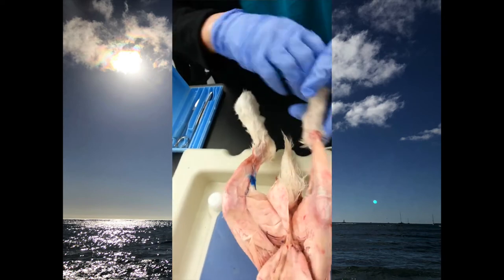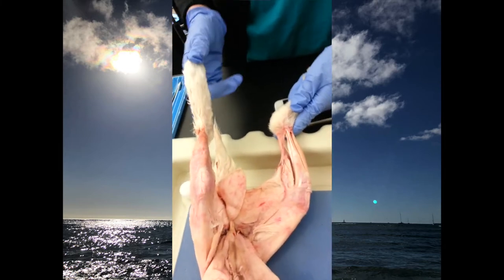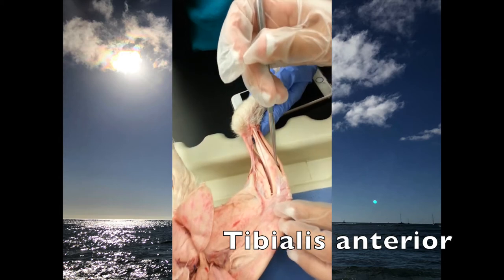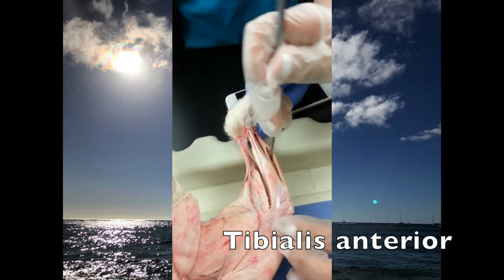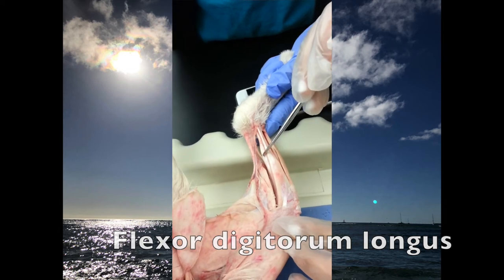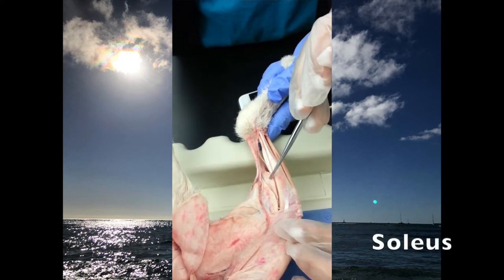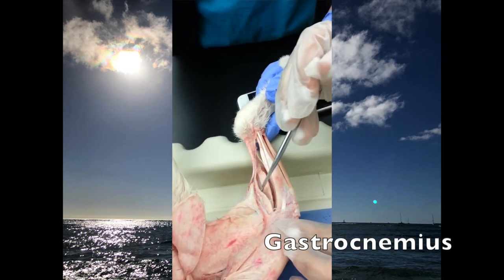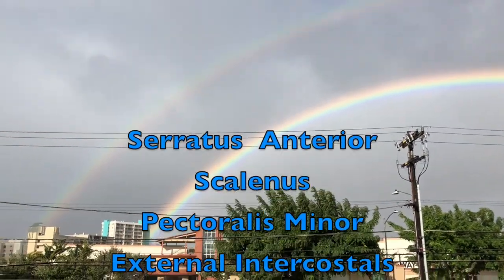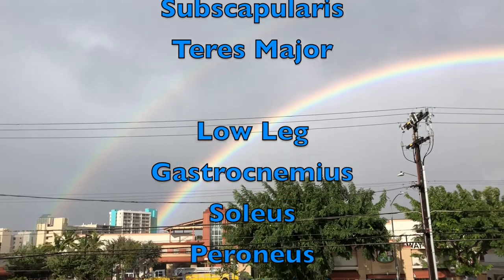And the inside? Which one's that one? This one's the tibialis anterior, and then the digitorum longus, and then the soleus is this one, and the gastrocnemius is this one.